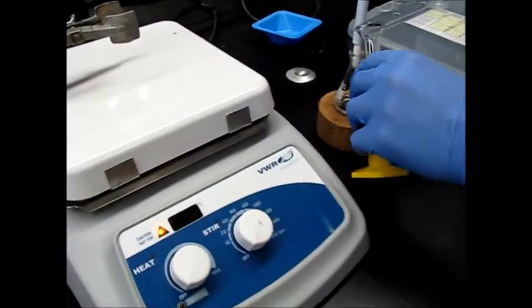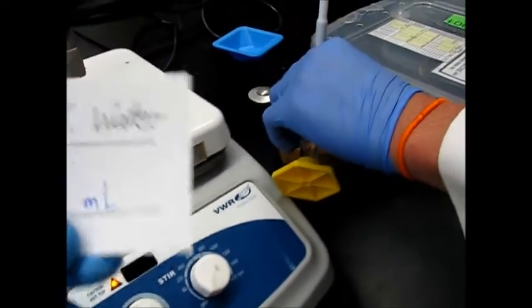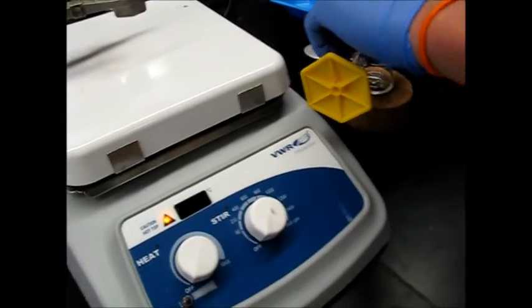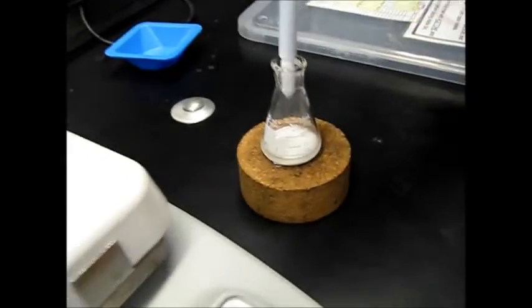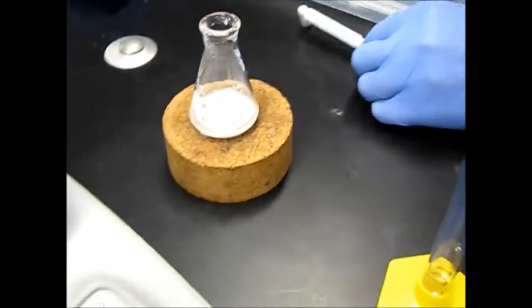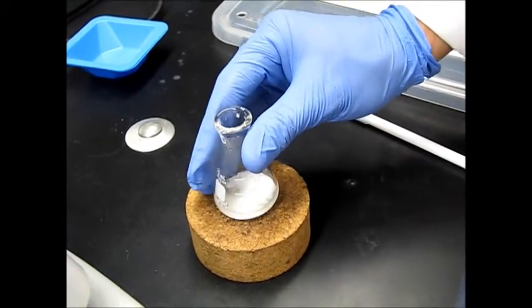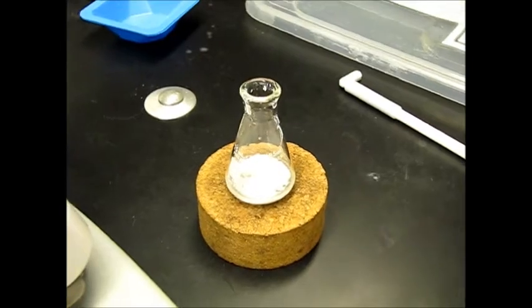and we'll add 2 milliliters of water, DI water. And we're going to rinse the stir bar a little bit, just to make sure we don't lose any product. And you see we get precipitation right there. So all that white stuff is our 9-hydroxyfluorene. It's soluble in ethanol, but it's not soluble in water. So whenever we add water, we make some of it precipitate out.